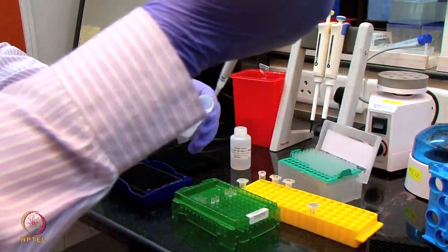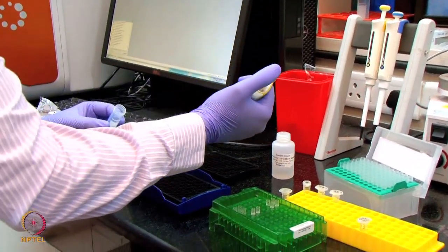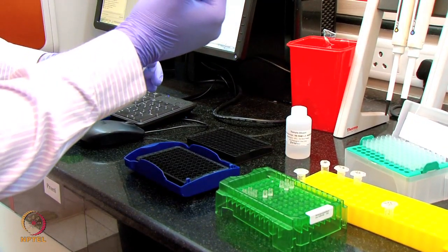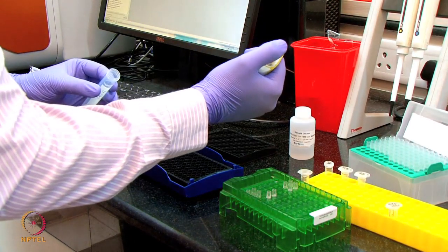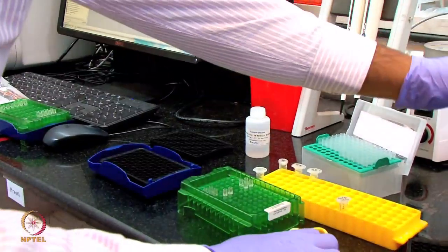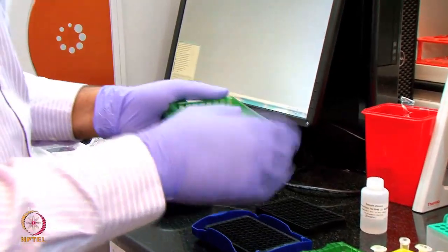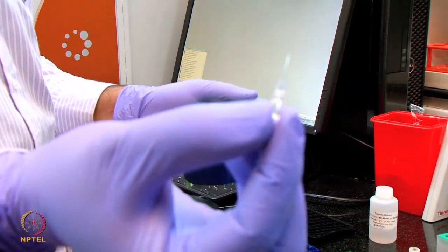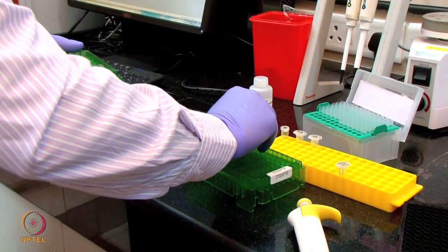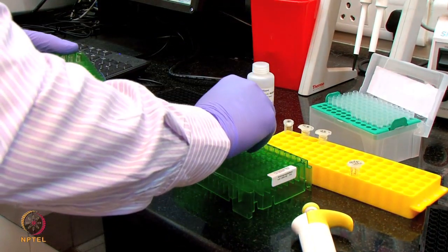What I am doing is adding 200 microliters of 1x PBS into a 96 well plate. Next step, I am taking the biosensors, which are the streptavidin sensors. These are the sensors, they look like this. I am going to put them onto the sensor tray. This is the sensor holder tray. I am putting the sensors like this.